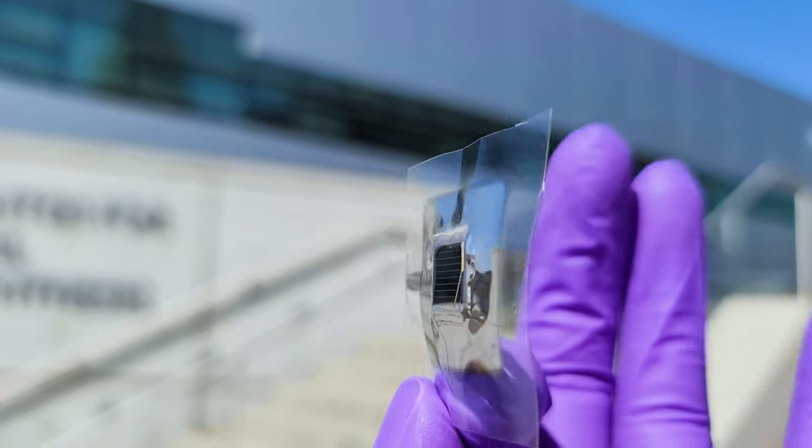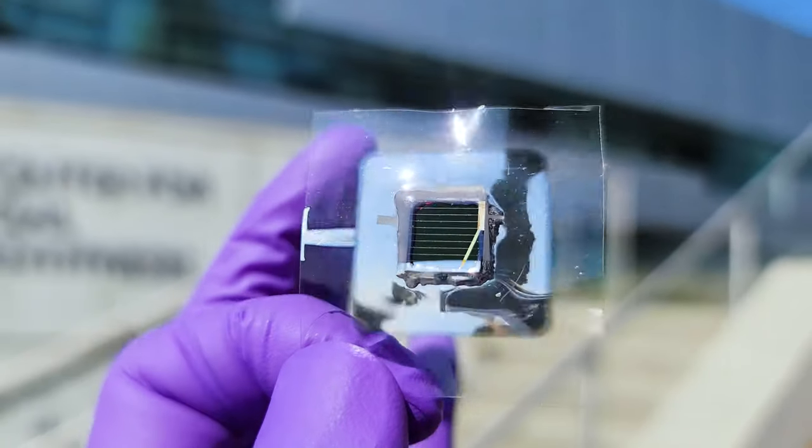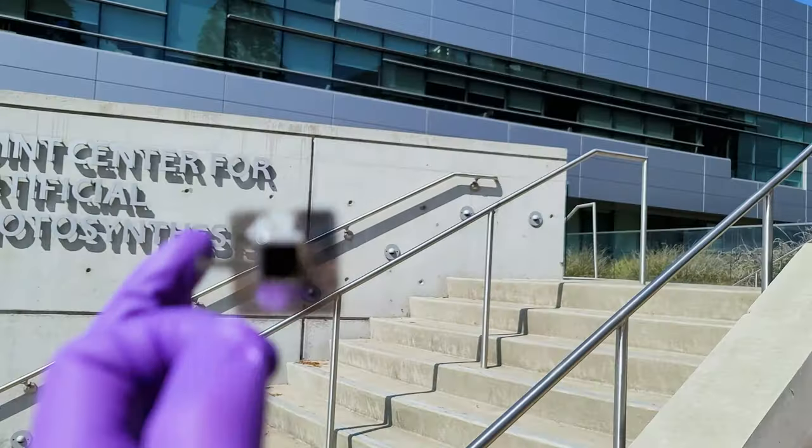The storage of sunlight in liquid fuels via artificial photosynthesis is the focus of fundamental research being done at the Lawrence Berkeley National Laboratory.